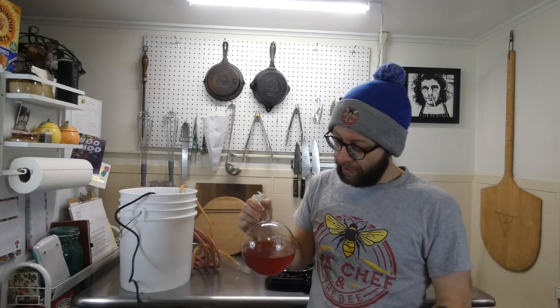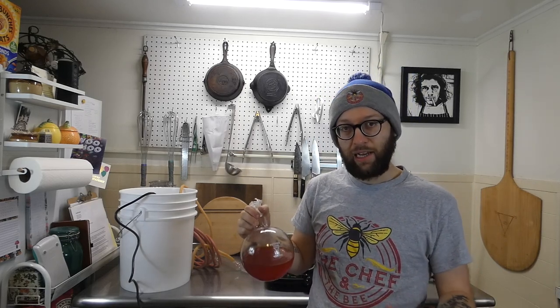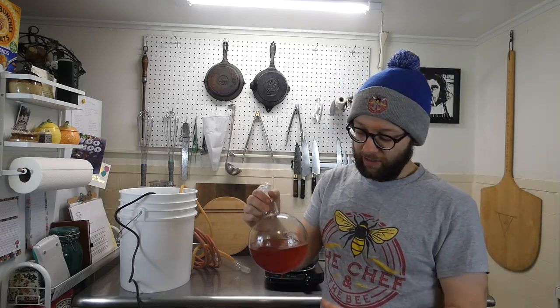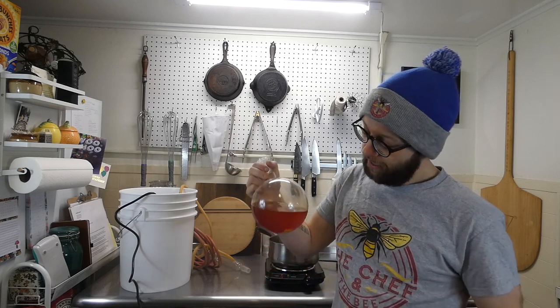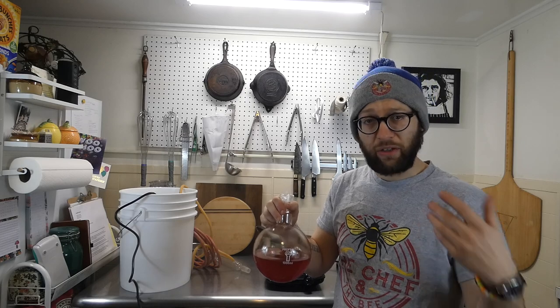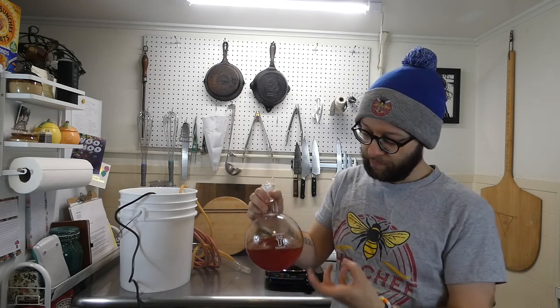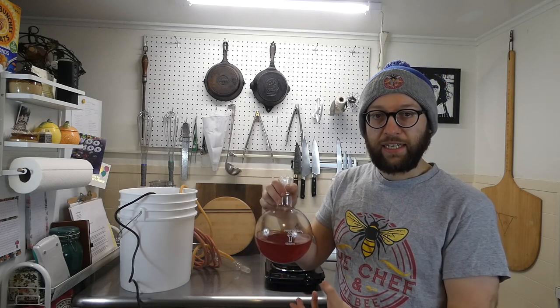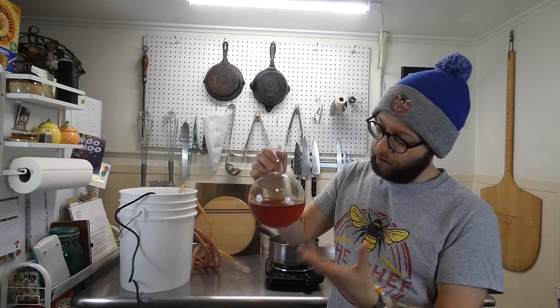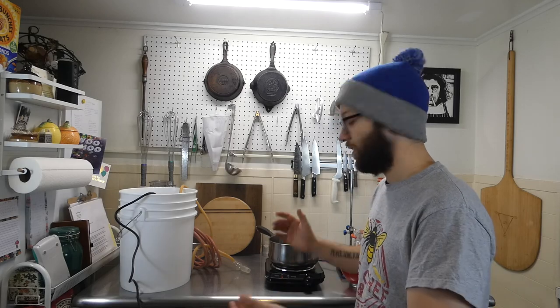Now, as I said earlier, this isn't going to be 100% pure, just because I'm not doing this in a laboratory setting. I don't have all the sophisticated equipment to isolate just the capsaicin. So this is going to be capsaicin, there'll be chlorophyll, there'll be a bunch of other molecules in this besides the capsaicin, but not going to harm you or anything, so not a big deal. All right, so now I'm going to set up the distillation process, and then I'll run through how that works, and then we'll just start distilling.